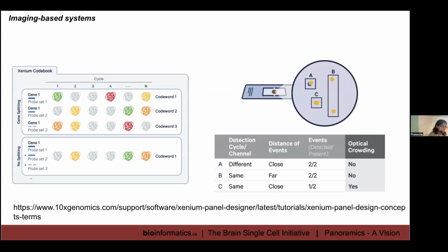And this is something that is on the 10x website. When I first started my Xenium experiment, I actually had to sit with an officer from their company and review how to design my probes, because I designed a full 414 custom gene panel. I was very naive then, and I kept pushing, no, can I have this? Can I have that? And it was a complete no, right?